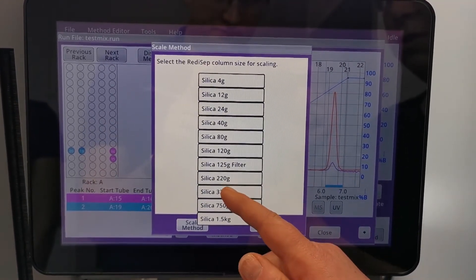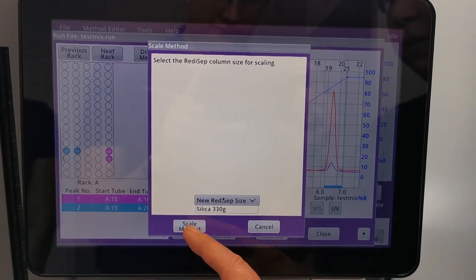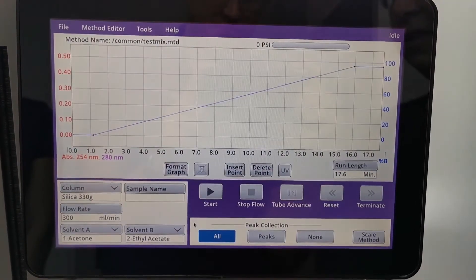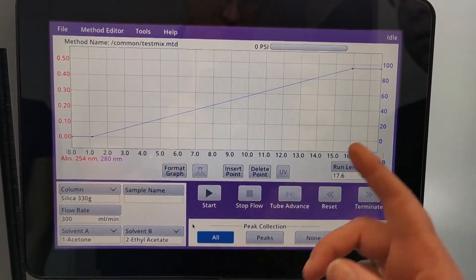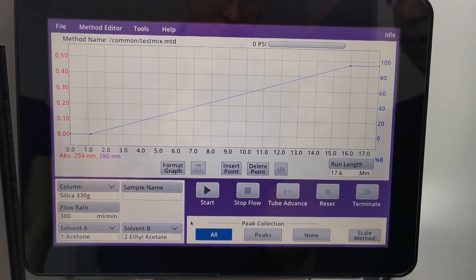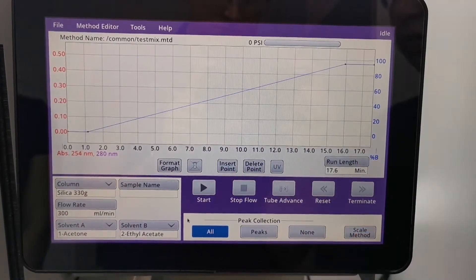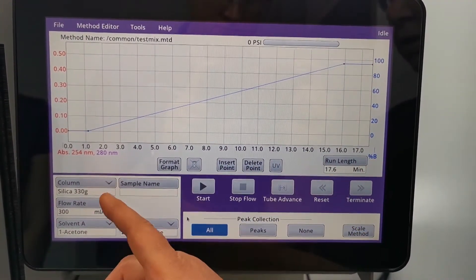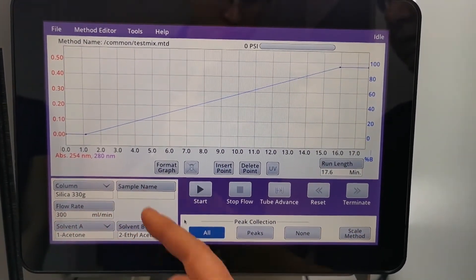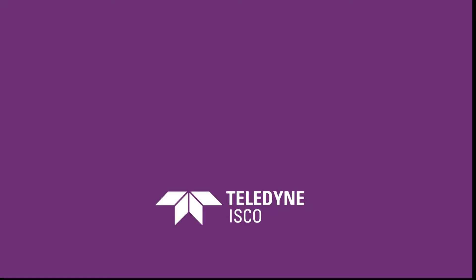So we choose the column we want to scale up, scale method and it automatically populates the gradient for you, setting your run length, your flow rates and you're ready to go. Easy as that.